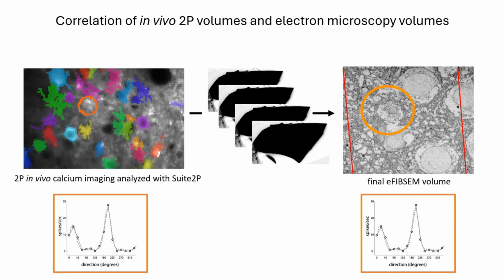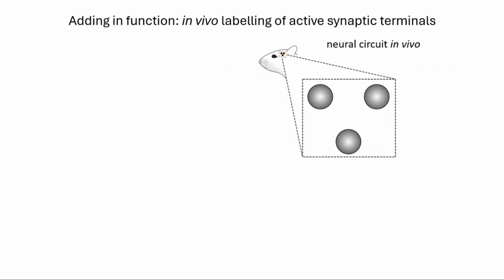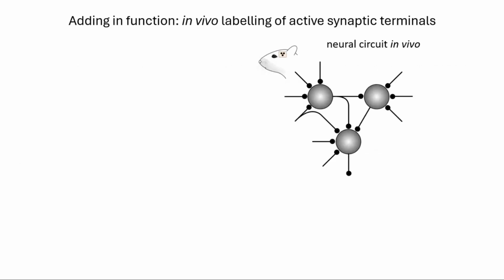And that's not the full extent of our problems. We had additional complexity because we are not only interested in the connections of these neurons within the in vivo circuit, the structural connectome, we would also like to know the weight of the synapses arriving onto these neurons and also the activity of these cells.